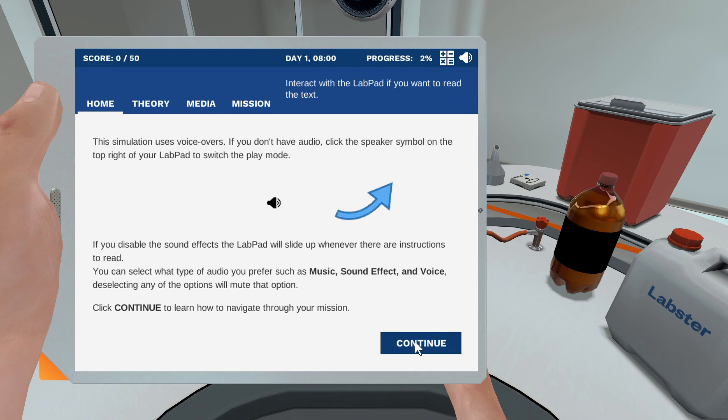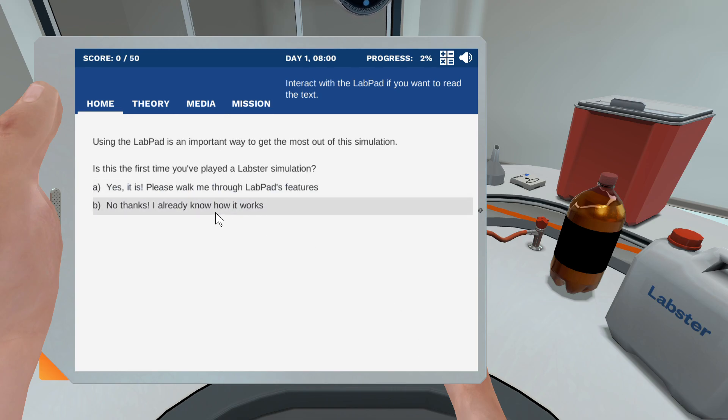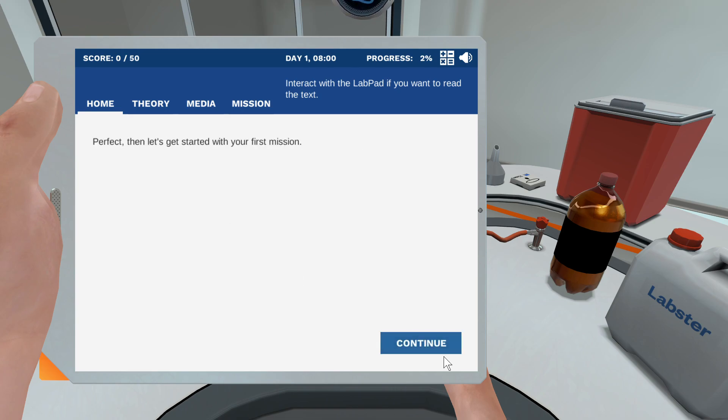This simulation uses voiceover. Using the lab pad is an important way. Then let's get started.